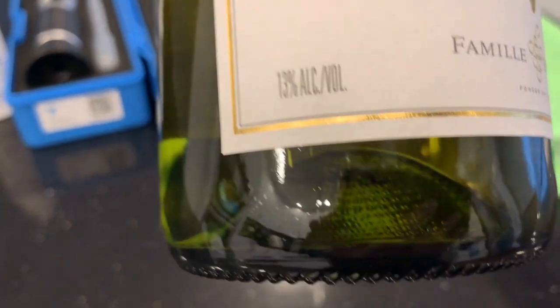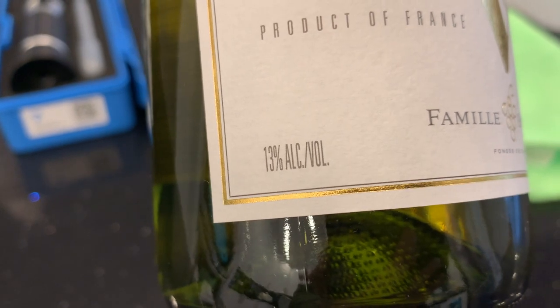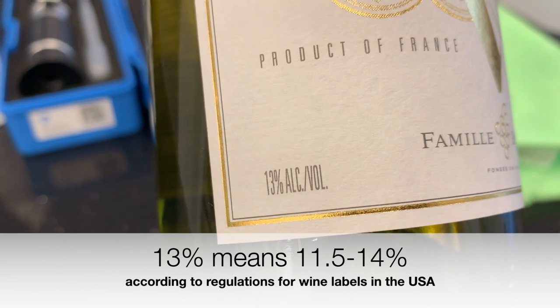It says 13% alcohol by volume on the label of this white wine. That actually means somewhere between 11.5% and 14% according to the regulations for wine labels in the US.